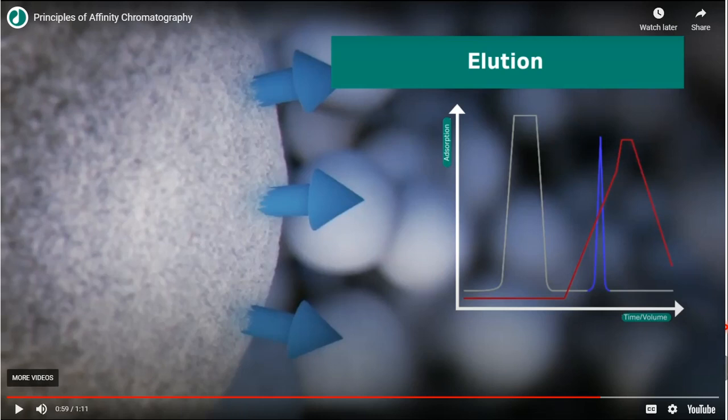And if you want to purify any enzyme, if it is a protein molecule, there is no problem. Maybe you can change the pH, like this method they already explained. This is the pH change, from the neutral pH to a higher pH level, and this molecule can be removed, and automatically the pH can be normalized. The problem is you can get the molecule by elution, but at the same time this molecule should not be degraded or otherwise denatured. So this is a major step, and you have to be very careful in that. You can study whether the pH is going to denature your protein or not. If it is not denaturing it, then you can go with the pH change. Or if it is denaturing your protein, you can go with the alternative method, that is addition of the free ligand molecule.